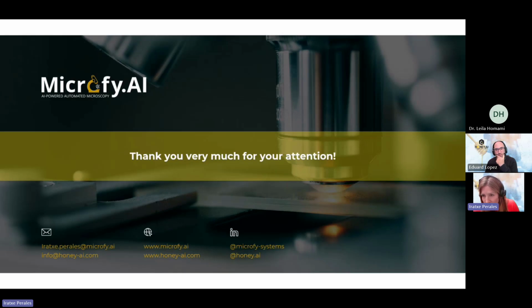How does the system manage floral sources such as Suya, citrus, or Tilia castaña? You can indicate that it's polyflora, for instance, and in the full spectra, you will see everything. If you want to know a specific concentration, for instance, for citrus that is below 9%, indicate citrus and you will receive the specific concentration. Otherwise, check in the full spectra. But yes, Suya, citrus, Tilia, castaña, all of them are well trained. They are very typical also in Spain. It works well, the accuracy is good.